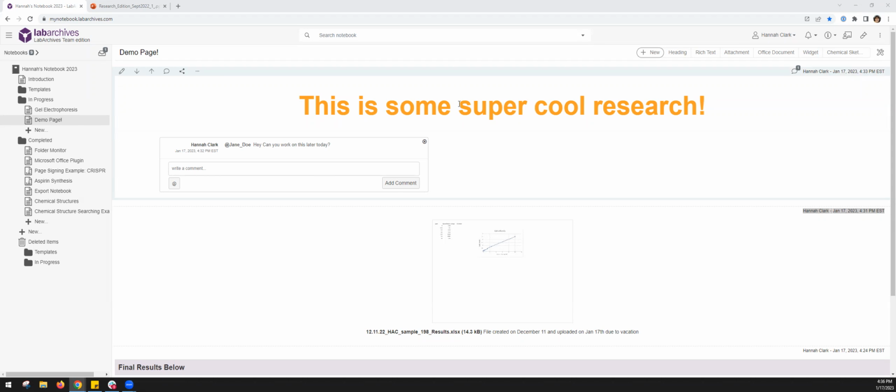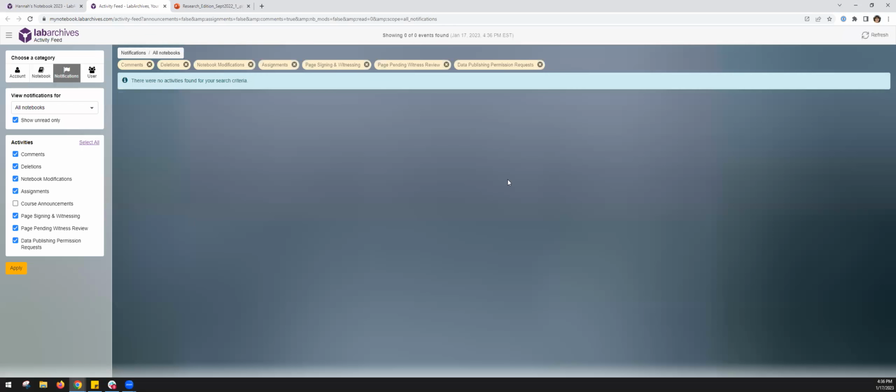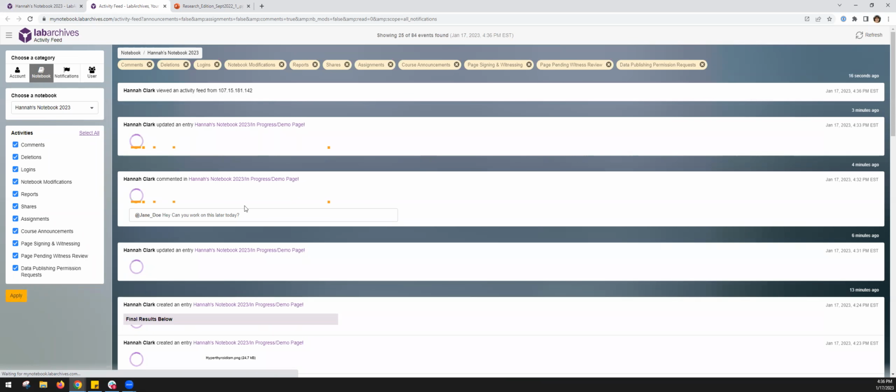All right. So I mentioned the activity feed here. Those comments are going to give me notifications. I can get email notifications about that. It can be in the activity feed as well. I can open that up at the top here. So I don't have any notifications in this case. I've already cleared mine out for today. I've been really productive this afternoon. But maybe I'm a manager and I just want to check in. I'm at the beach hanging out on my phone, just checking to see what the lab's been working on. And I want to set some filters here to see what's going on, see what I've missed while I've been out of town.